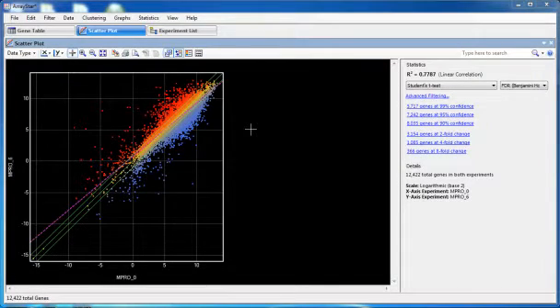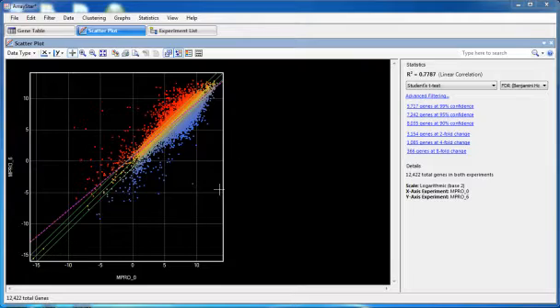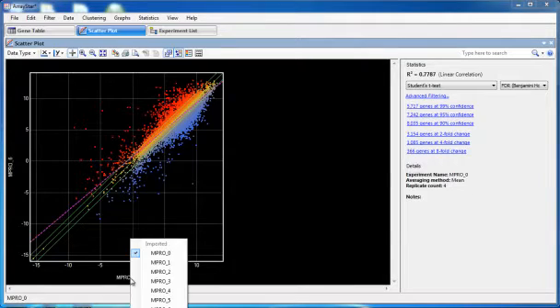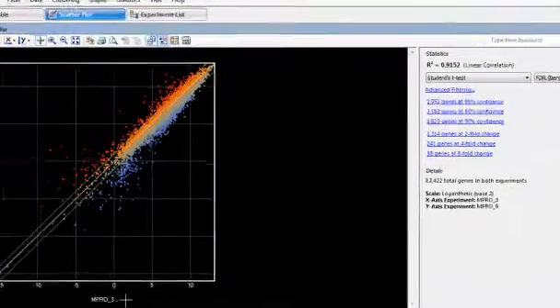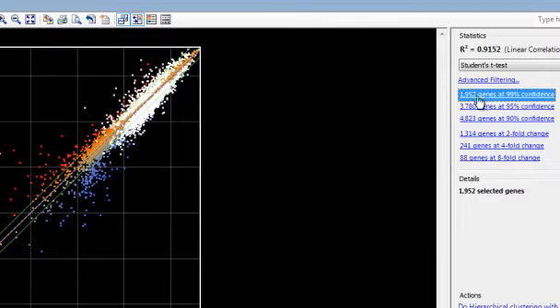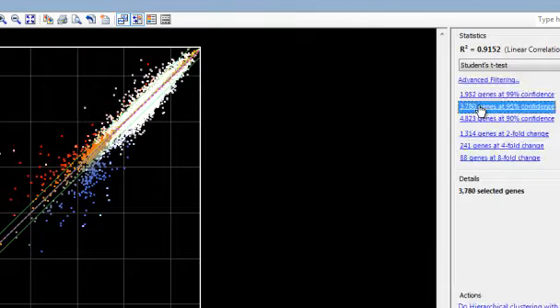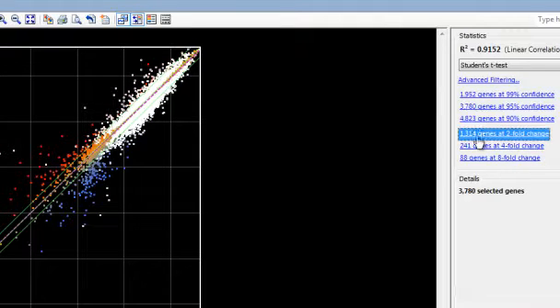Finally, you can compare replicate sets and use ArrayStar's statistics tools to identify genes of interest within the various ArrayStar views. For example, in the scatter plot, you can show one replicate set on each axis, and then select genes at various confidence levels or fold changes.